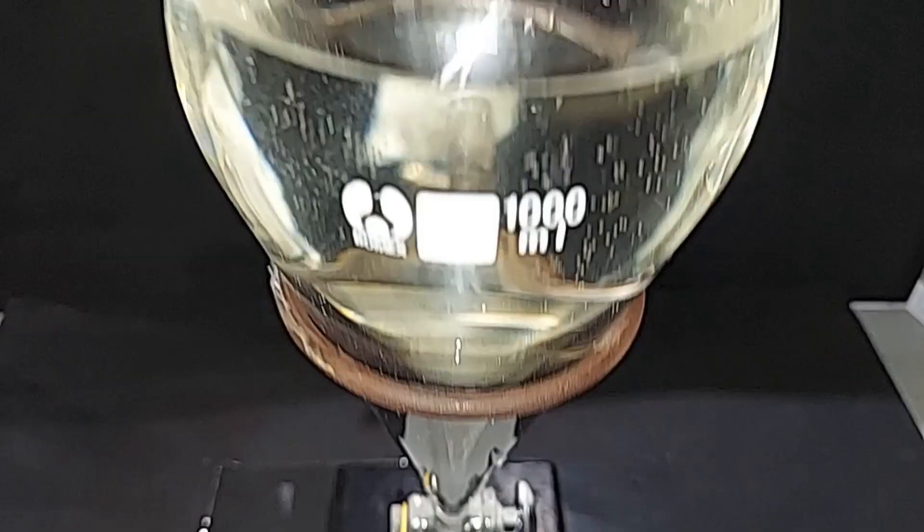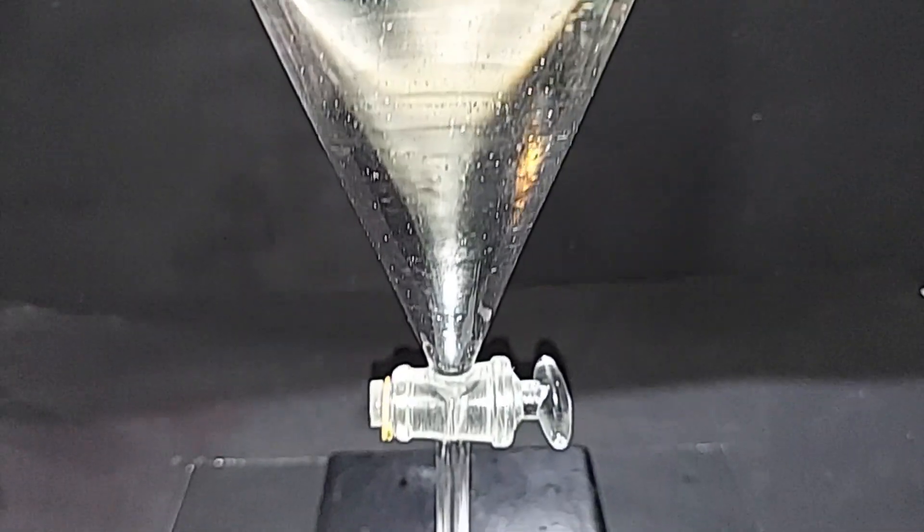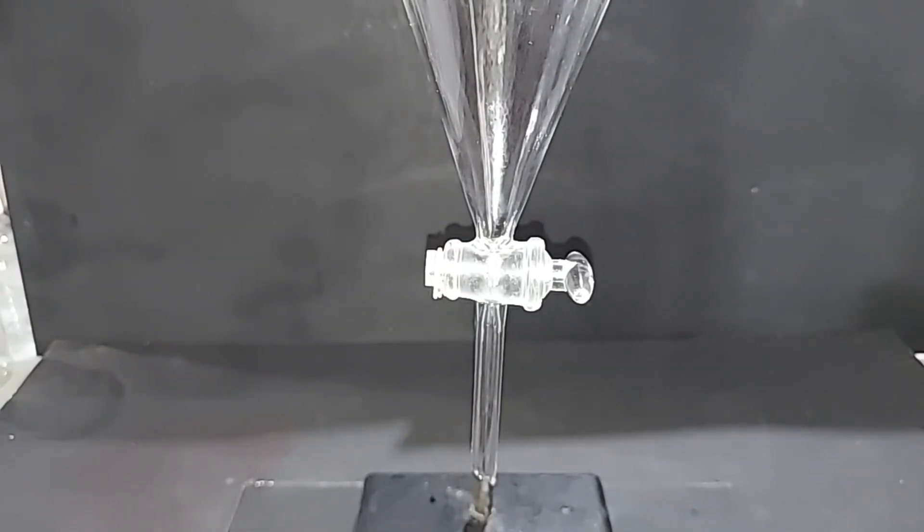Here's our crude chloroform. Of course, we're going to purify it next. I'm going to discard all of this and then clean the separatory funnel, and then we'll be back to wash the chloroform with the salt solution.